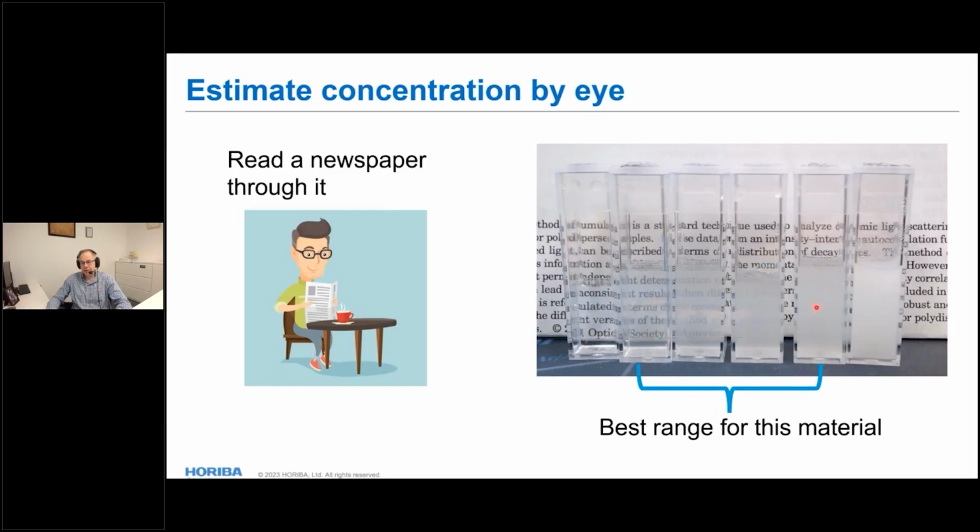This one on the right side was more opaque than I would have guessed, but hey, data is data, it shows what it looks like. But these three in the middle, and particularly this one in the middle here, it's a bit cloudy, but you can still read through it. And so that's a good starting place for your material concentration. And quite often I wind up working here or here.